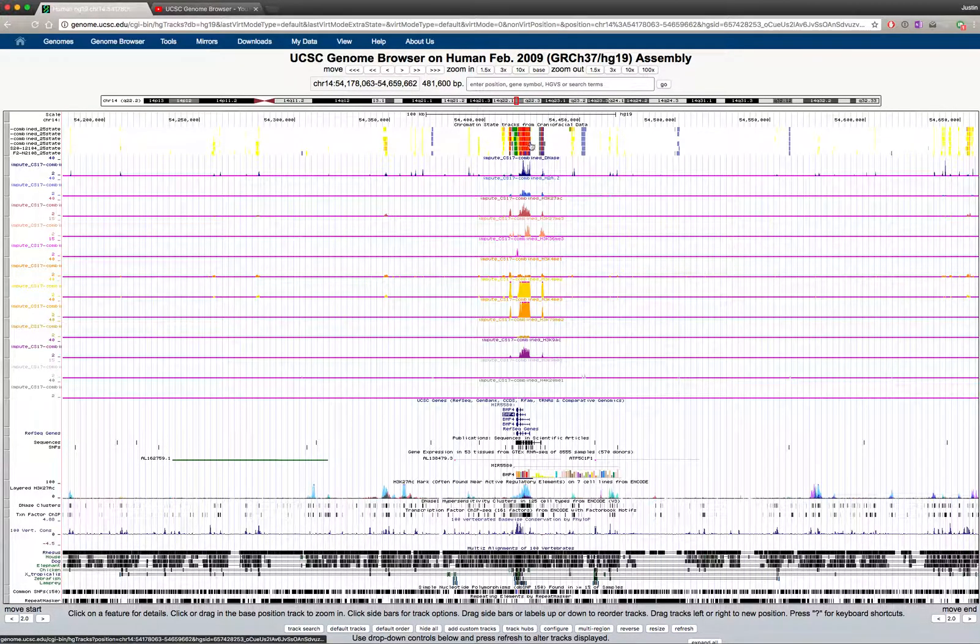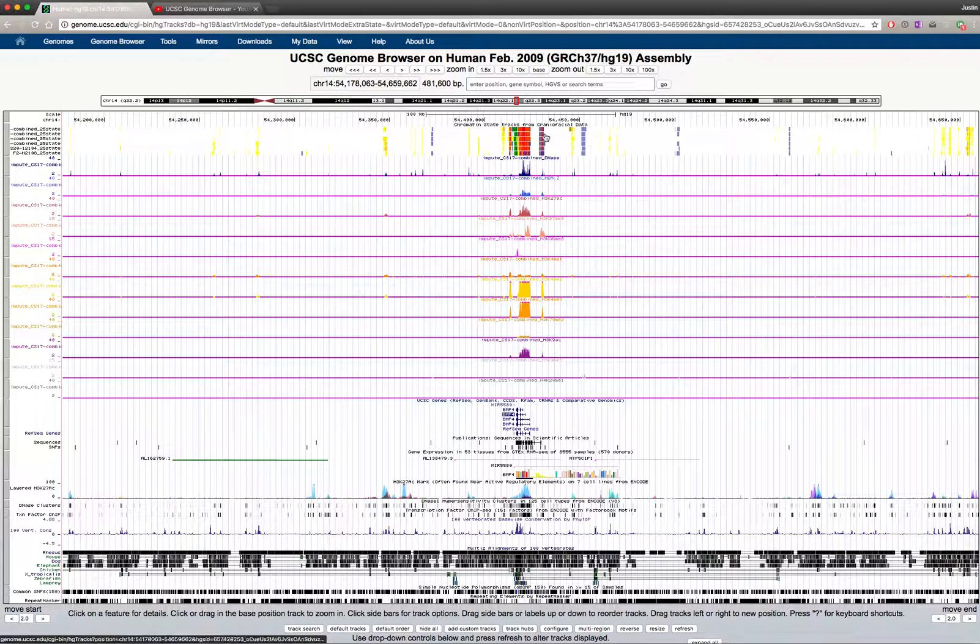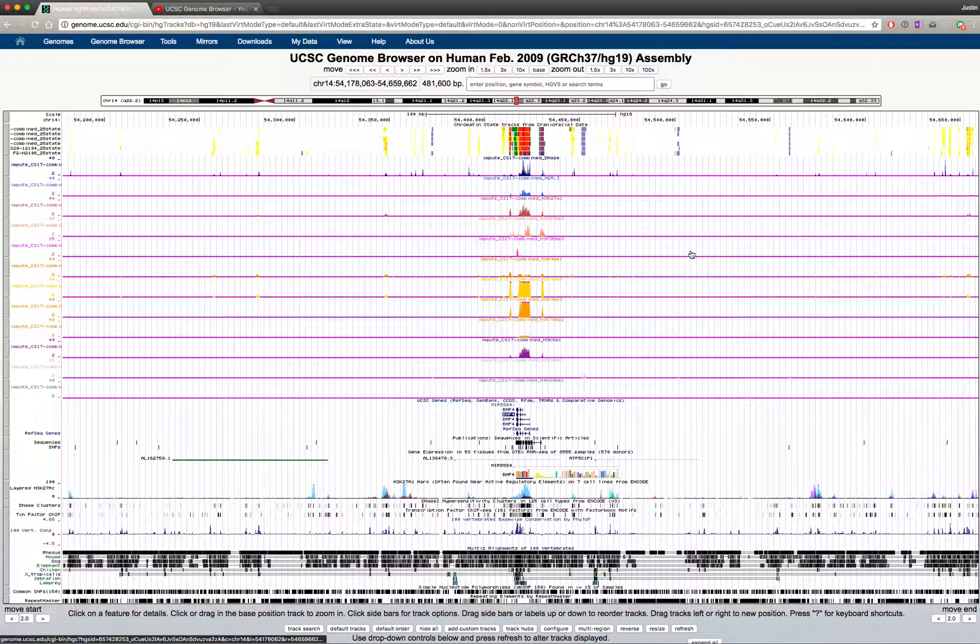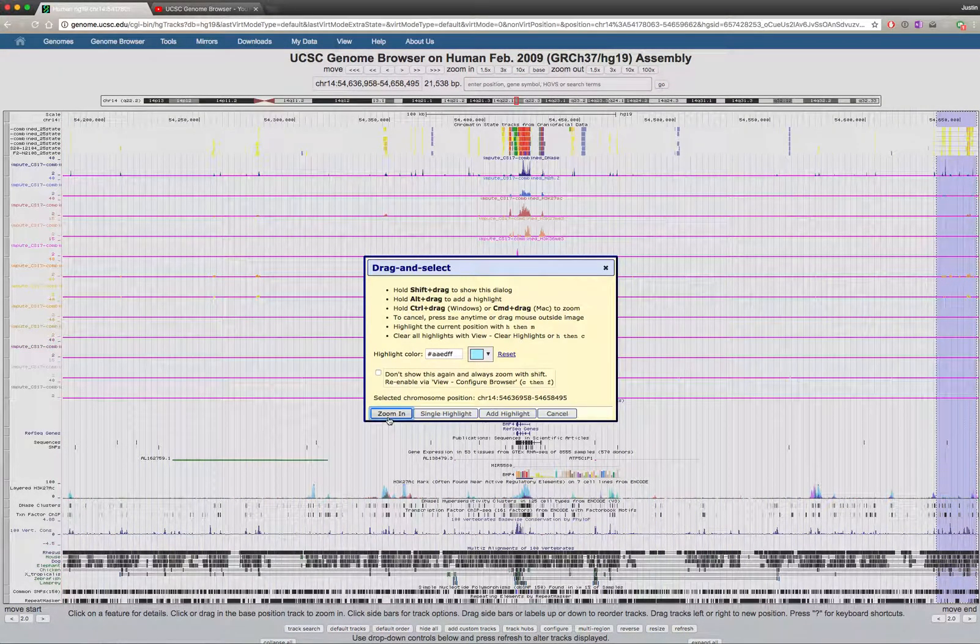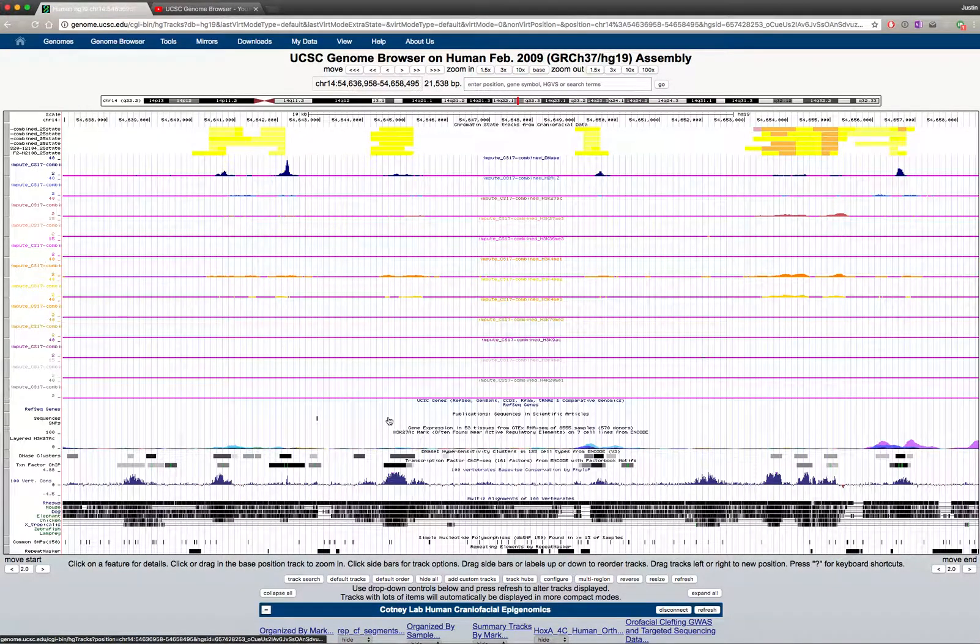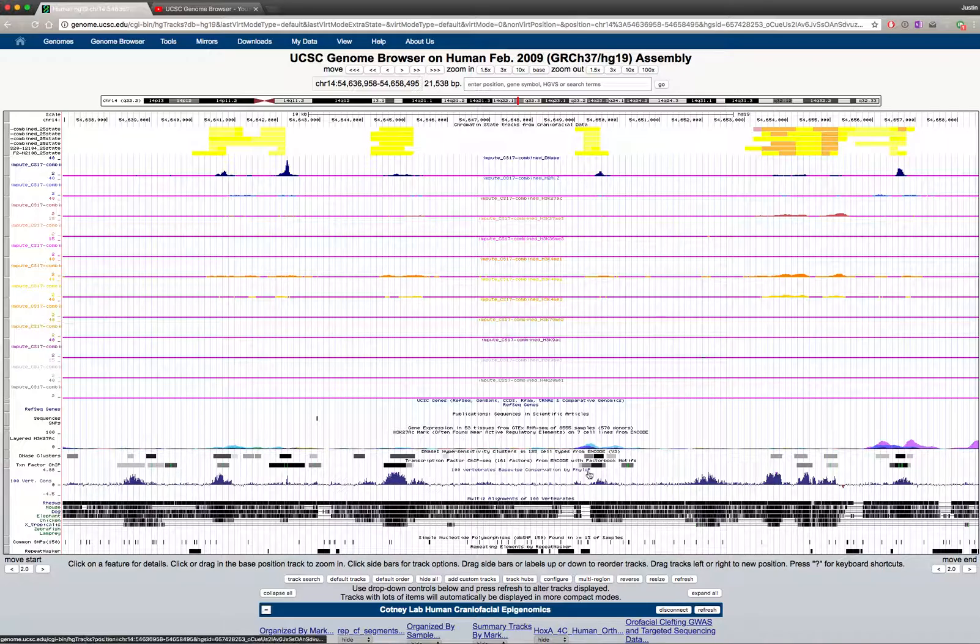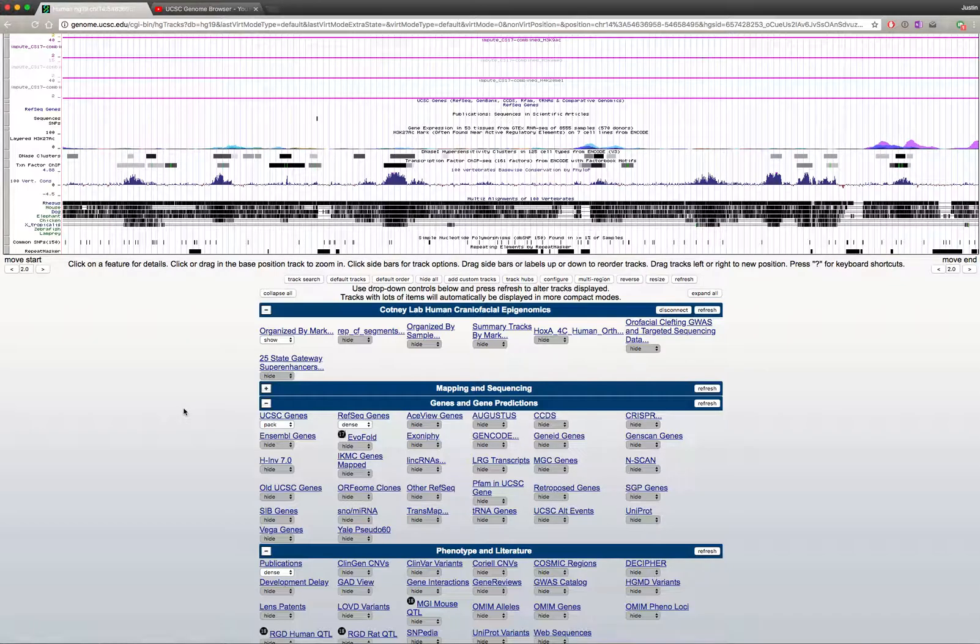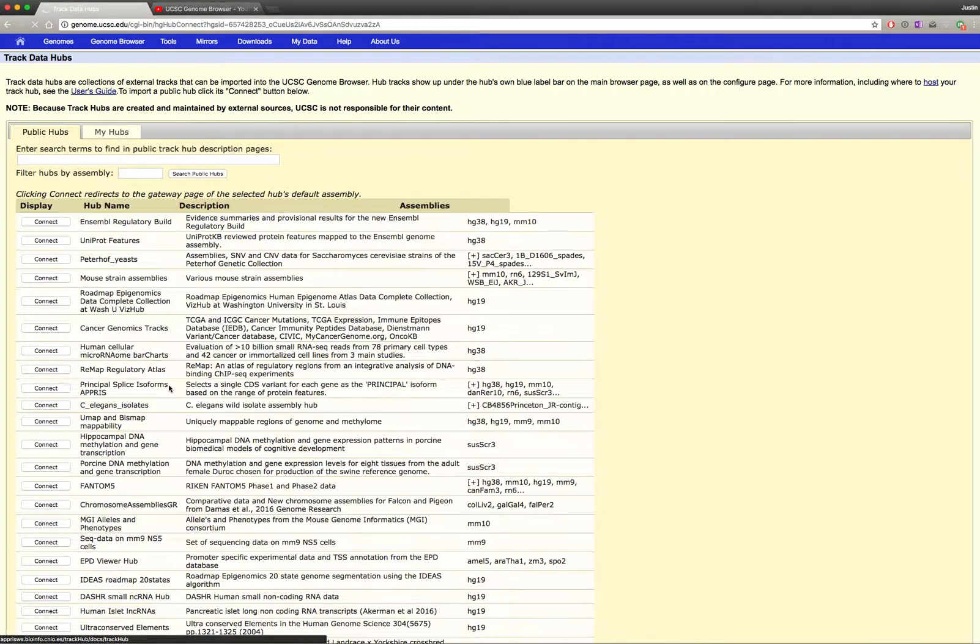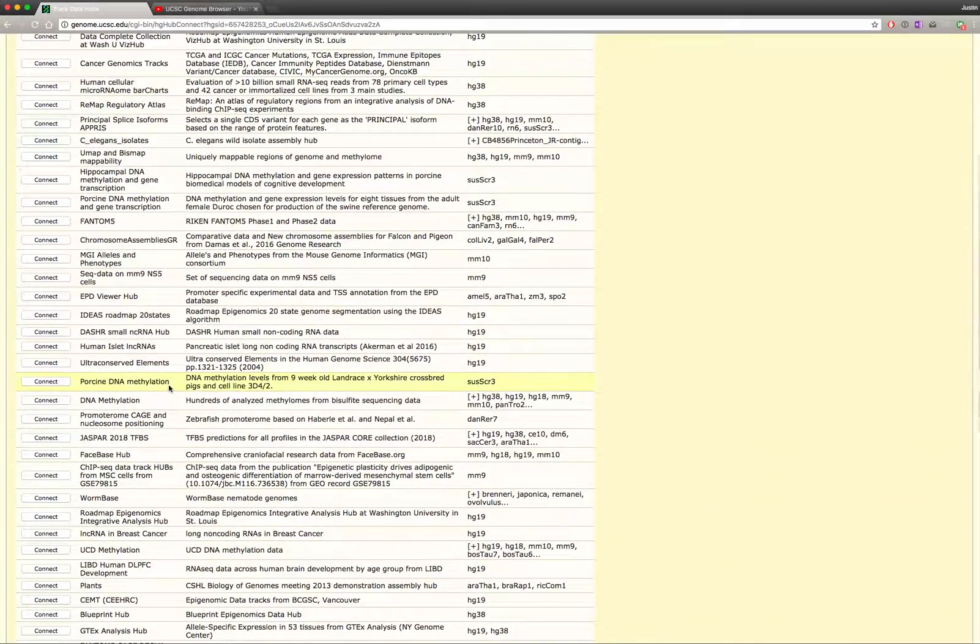You can see this very strongly bivalent region for BMP4 and a whole host of regulatory elements surrounding it. We've got a 500 kilobase window surrounding BMP4. We've got a number of enhancers that look like they're very strongly active out here, so we can zoom into these regions. You can see a whole battery of conserved regulatory elements that look like they're active in our craniofacial tissue. The great thing about the UCSC genome browser is there's a lot of other data that you can plug into.